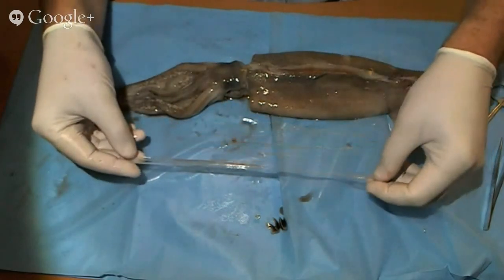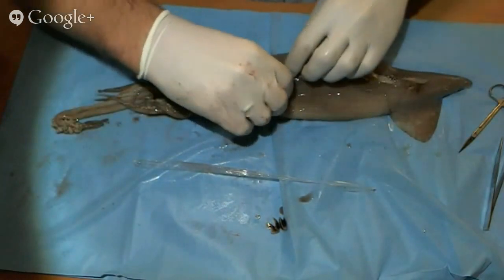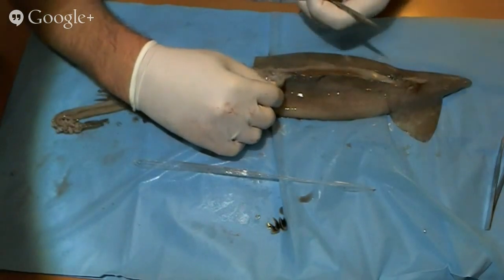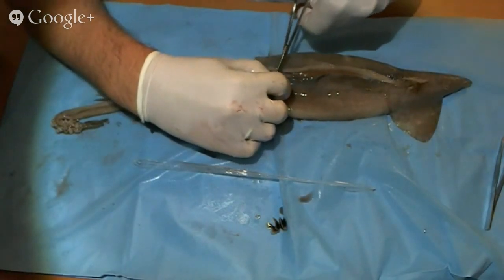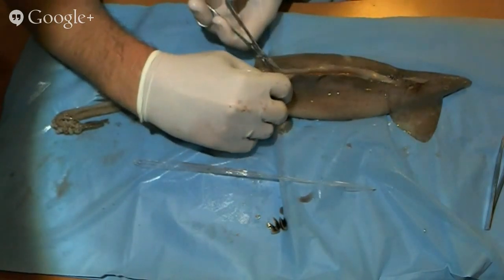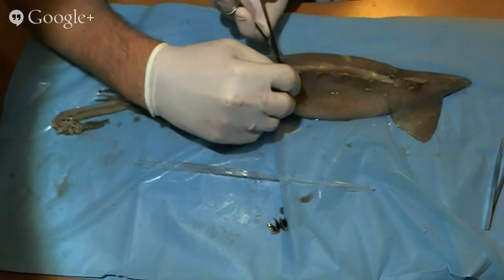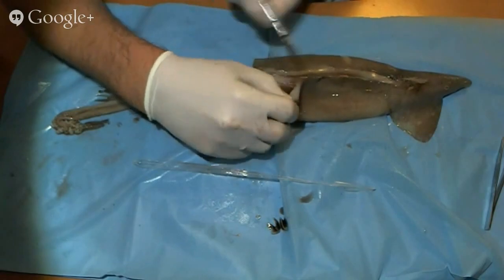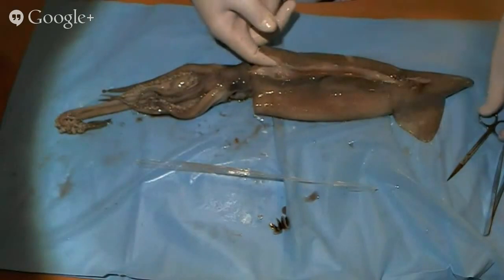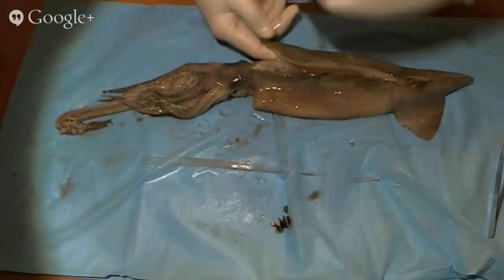It's used to keep the squid's mantle in a strong shape, and it allows for it in certain ways. Actually, I'm going to guess on this one. I think it allows for more muscles to push against, just like our muscles and bones work together to push against each other. So the structure of the mantle stays intact, but you're also able to use this piece of cartilage as a way to push off a little bit.